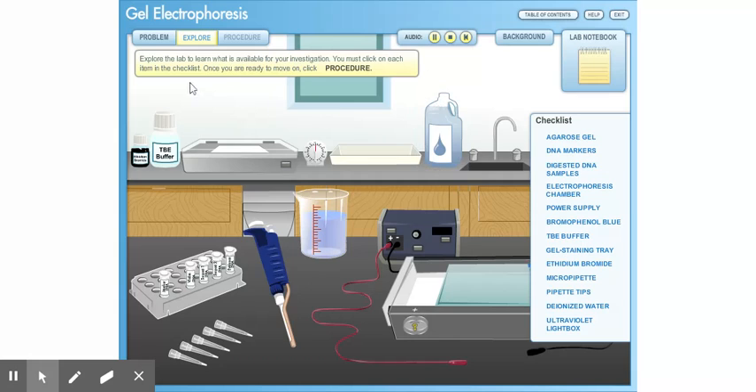Explore the lab to learn what is available for your investigation. You must click on each item in the checklist. Once you are ready to move on, click Procedure.